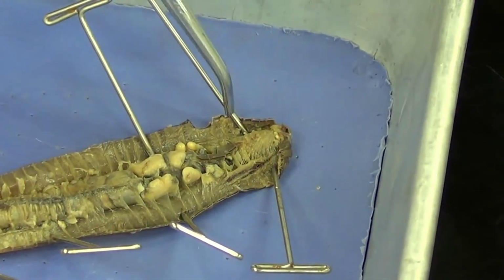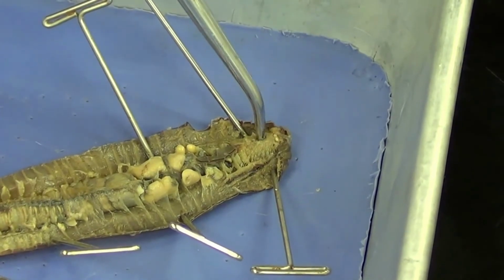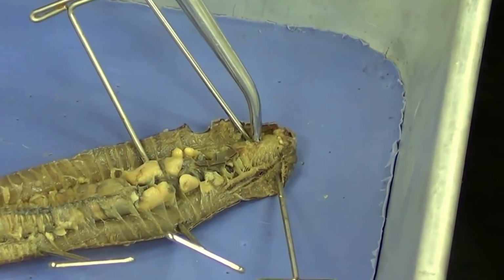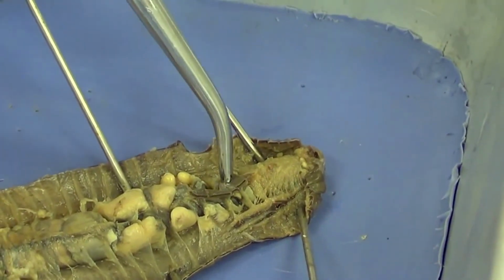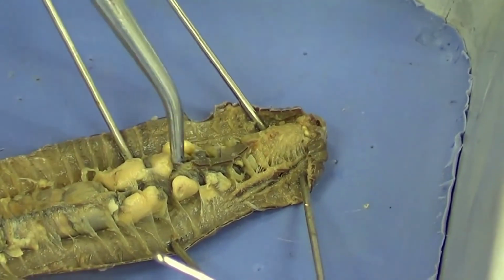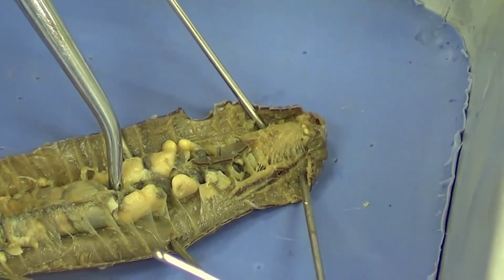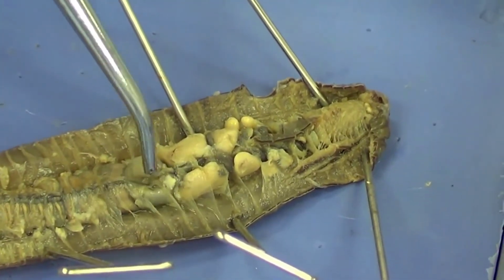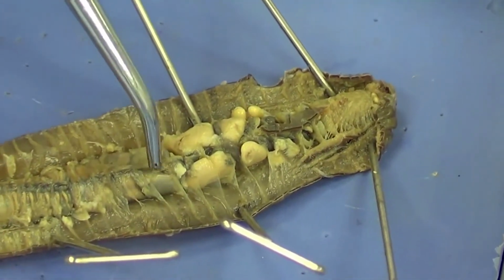And then the next part of the digestive tract is going to be this part right here. This dilated part right here. That's going to be the pharynx. And then underneath here, this is not going to be possible to see, but underneath this material here is going to be our esophagus. And then we go into this pouchy area. You can see how soft that is. You want to push on that with the probe a little bit.